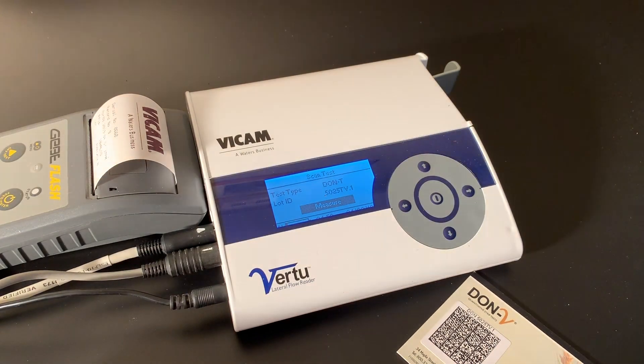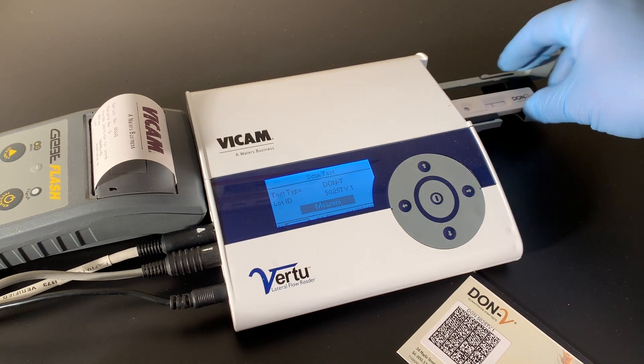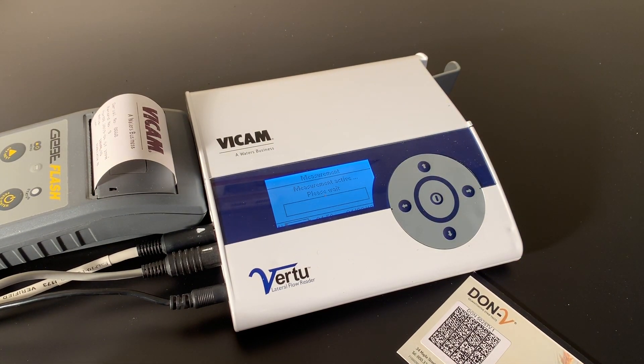When the 5-minute timer is complete, scan the Virtu calibration barcode unique to the test. There is a different barcode for every lot of strips. Place the strip inside the Virtu reader with the round opening facing inwards.